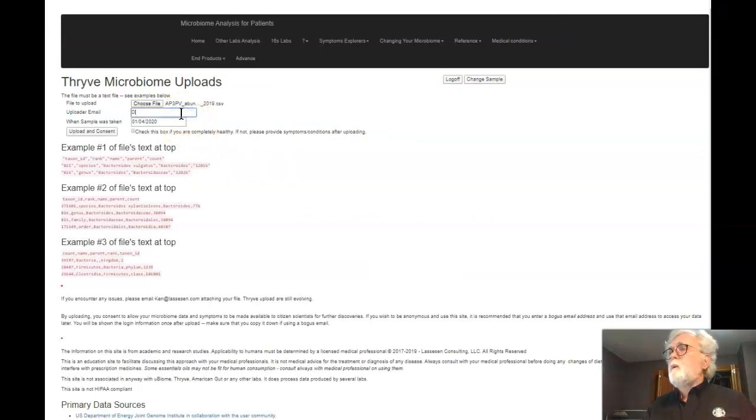In this case, I'm going to not put in my own email address. I'm going to put it into the shared demo site, which you're welcome to do. Basically, it samples from one or another person, which anybody can access because the login and the password are public, and it simply allows people to anonymously share things. Most of the time you will be putting in your email address and then an upload address.